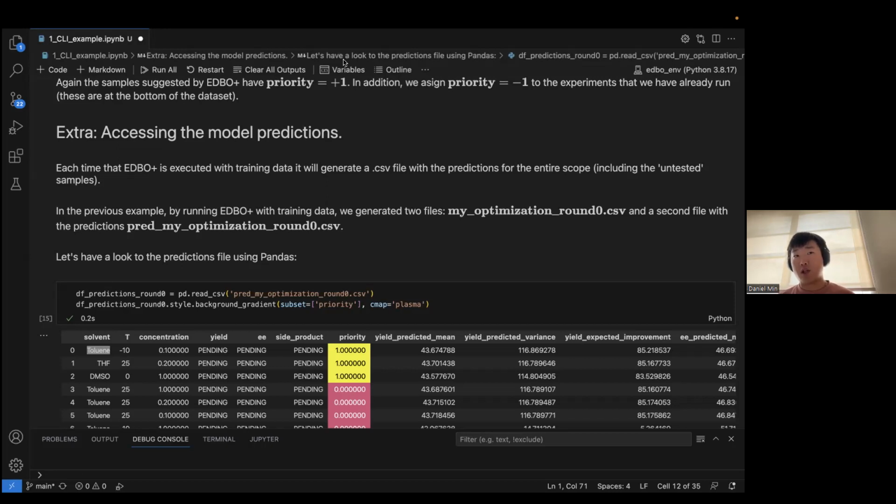A couple of ways you can go about this: number one, you can have a custom weighting function where you place more weight on certain objectives. Another one is you can just input one objective and have something like isomer yields. But again, that runs into the same problem. So I think it really depends on the situation, and in my experience, we came down to trial and error.